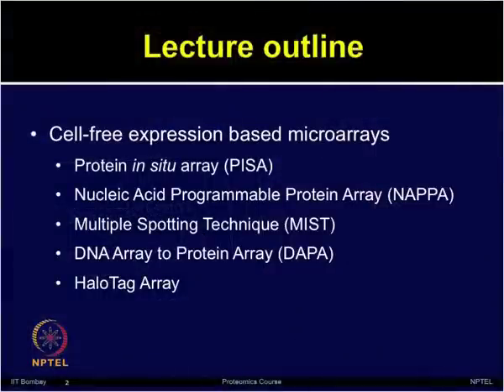So, in today's lecture, we will talk about cell-free expression based protein microarrays. I will give you an overview and the principle of various cell-free expression based protein microarrays.